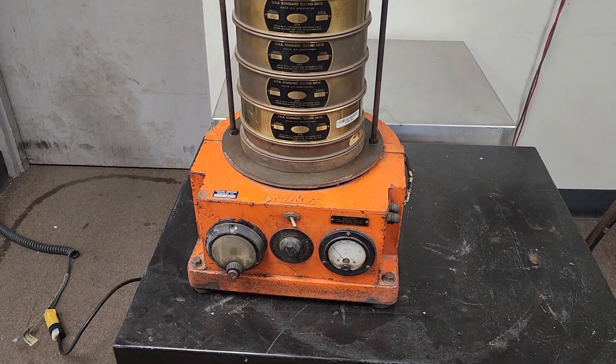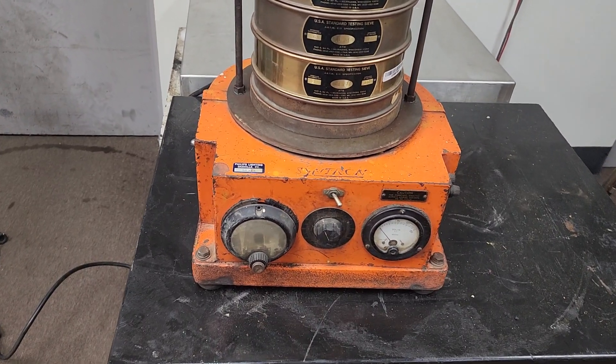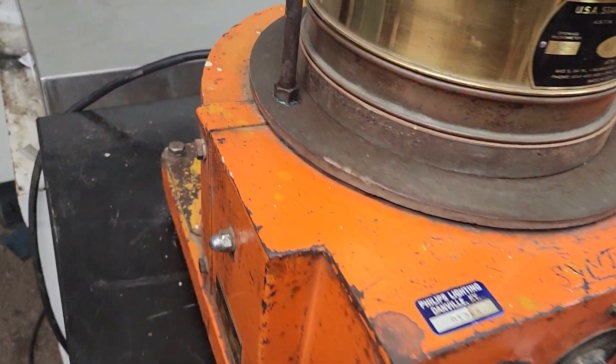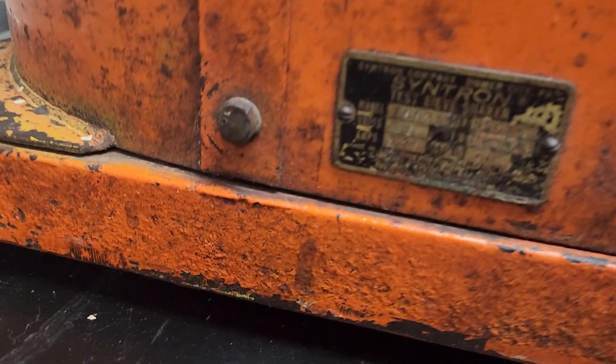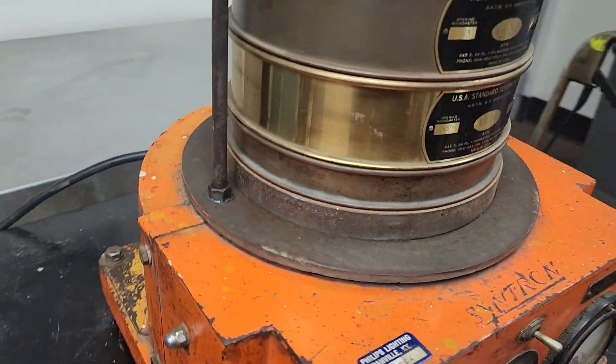This is a Syntron test sieve shaker. The number is TSS-31. It plugs into a standard household current.